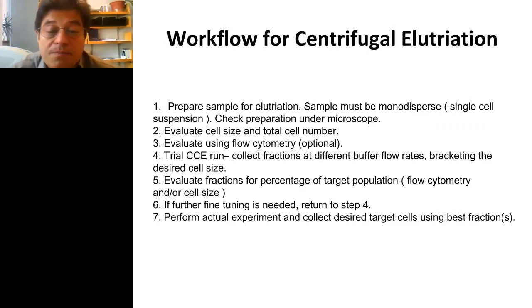So just to show you briefly the workflow on how we pursue this and refine this technique.